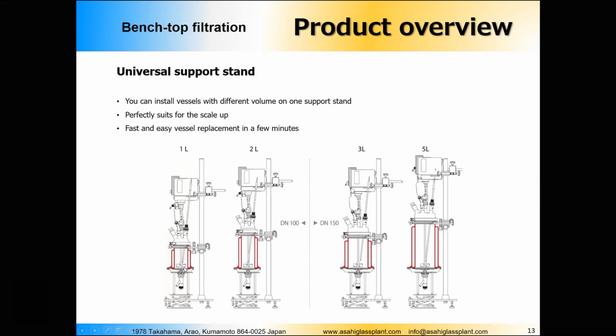The important thing is the internal diameter and the ratio between the diameter of the stirring blade and internal diameter of the vessel. Why? Because the bigger the diameter of the stirring blade is, the better it is. I will explain to you why it is so later on, when I show you the type of the stirring blades that Asahi offers.